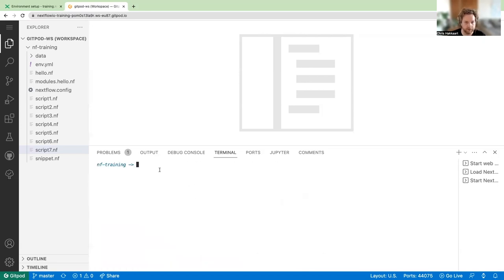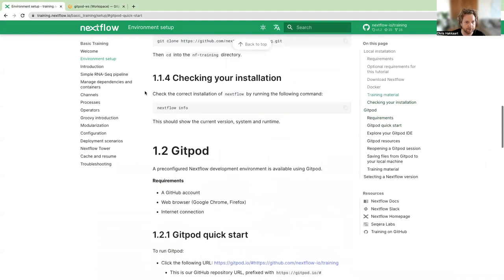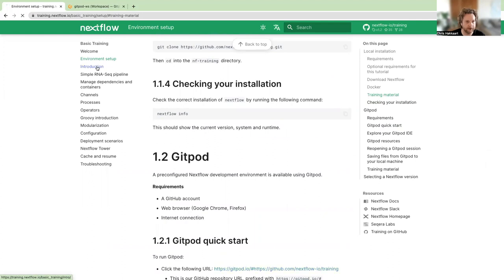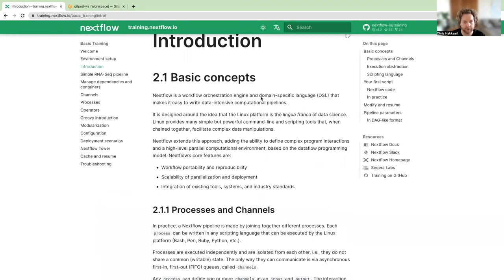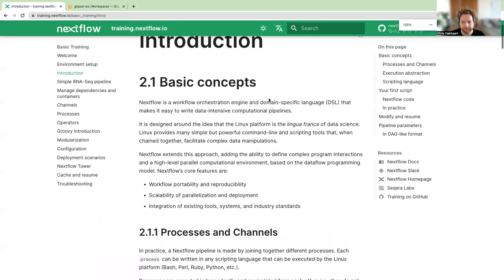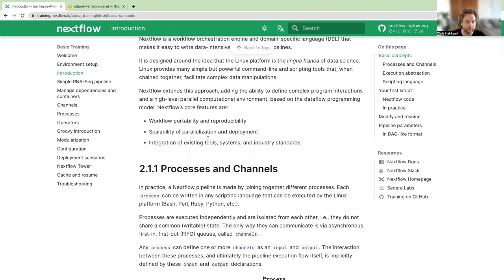Now we'll go through some of the introductory material. We'll click on 'Introduction' in the training material, which covers basic concepts — reinforcing some things from the initial slides. Nextflow is an orchestration engine and domain-specific language, or DSL, that makes it easier to write data-intensive computational pipelines. Its core features include workflow portability and reproducibility, scalability of parallelization and deployment, and integration of existing tools, systems, and industry standards.